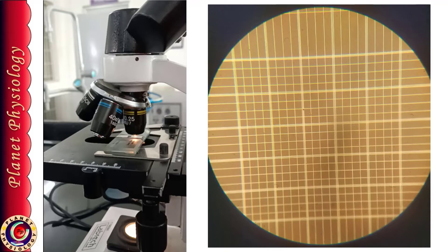So high power objective is either 40x or 45x depending upon your microscope. Many students find focusing under high power very tough because the common mistake they do is that they move the chamber away from the objective lens and then shift to the high power.